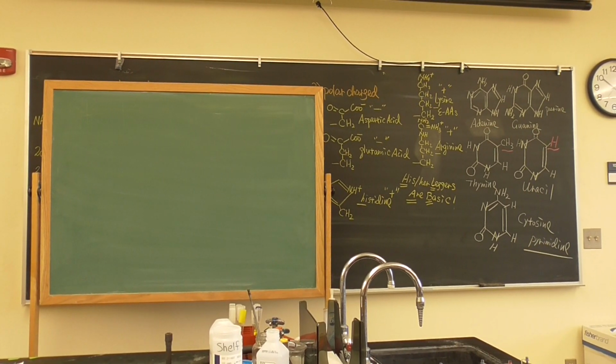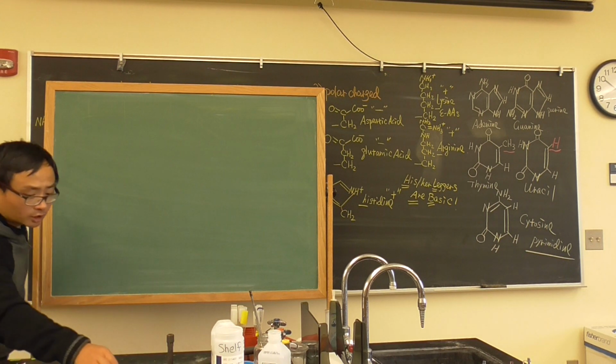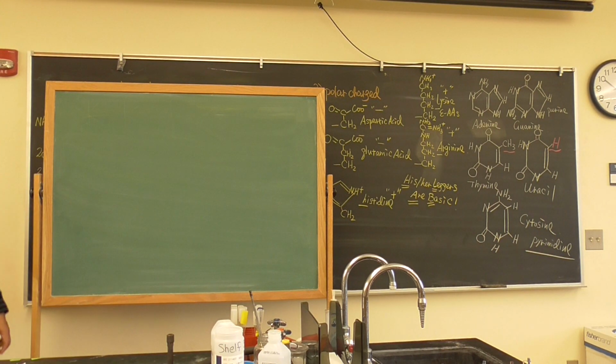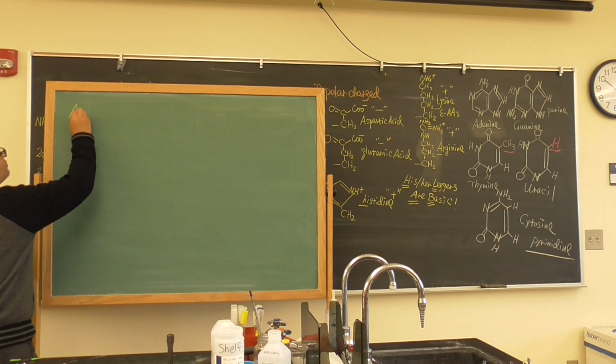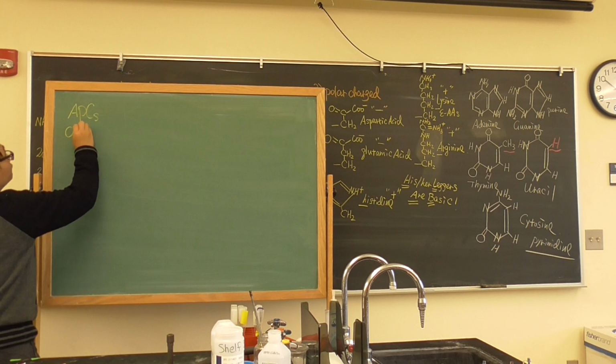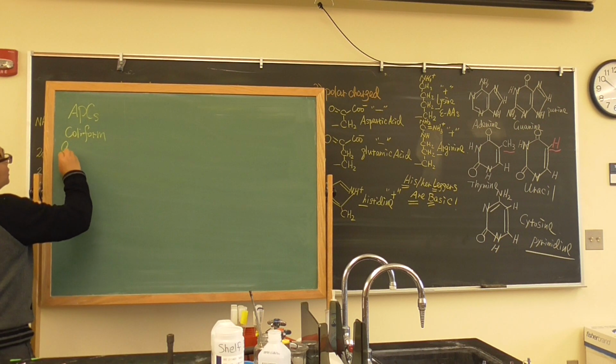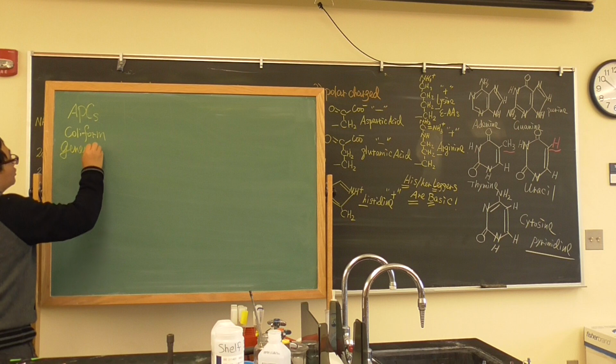Okay, what we're going to do today is analyze pond water for APCs, coliform, and generic E. coli.